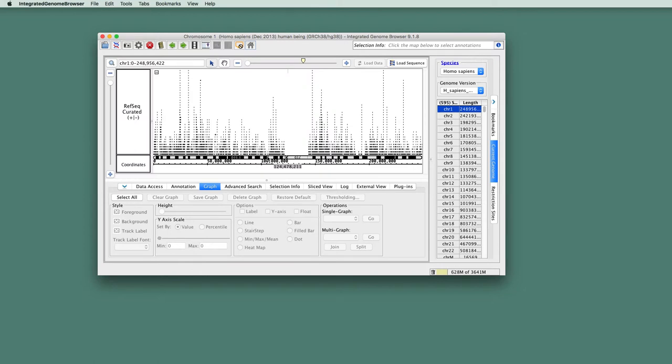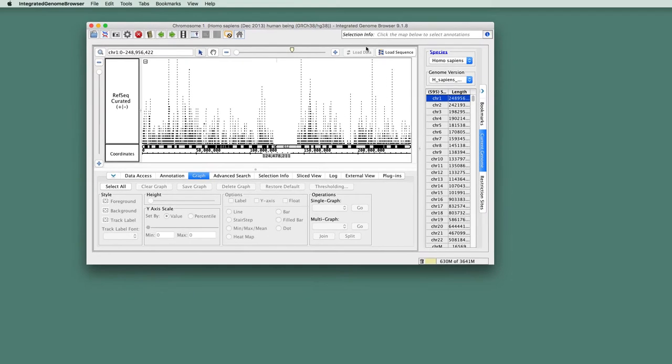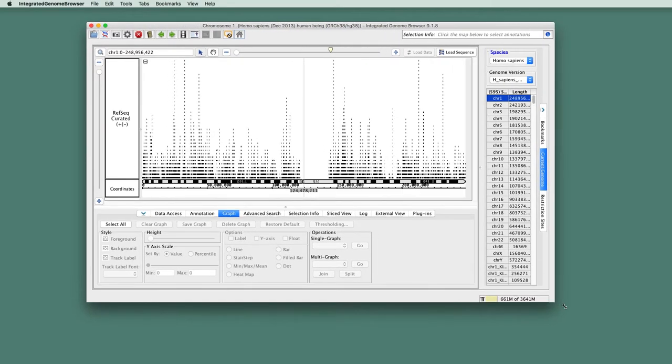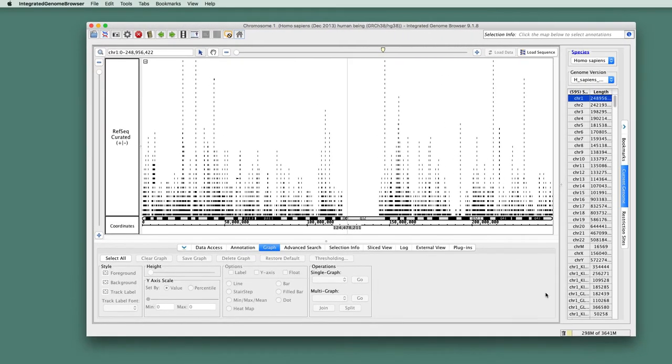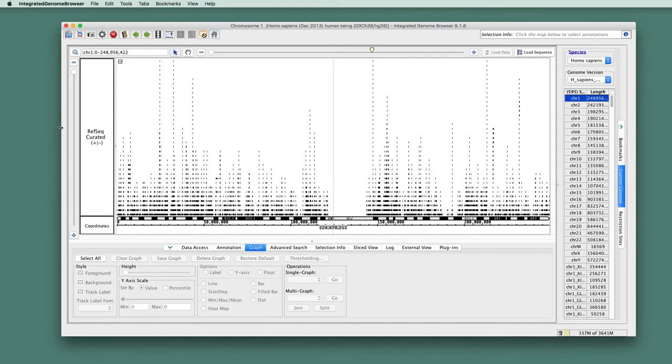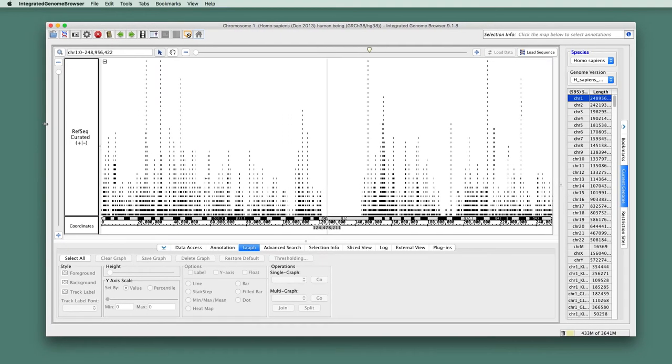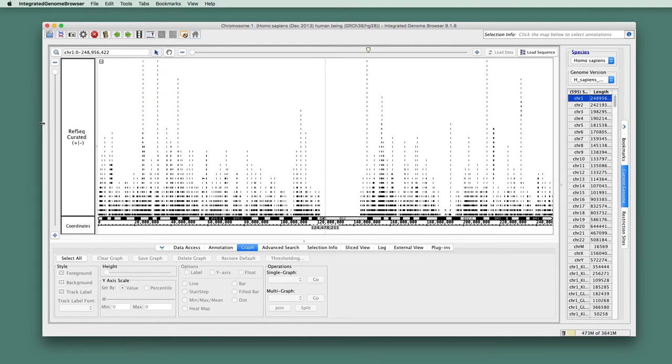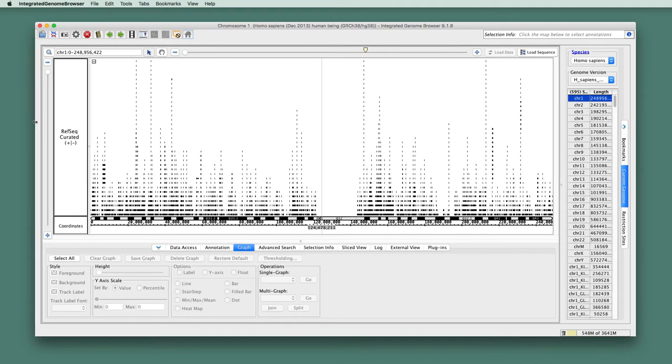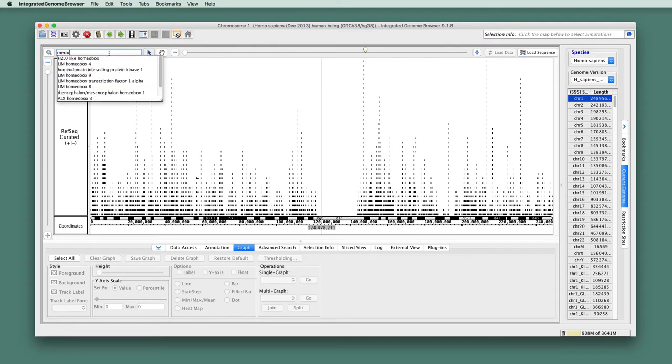ProtoNote is classified as an application plugin or an application app, which means it essentially creates an entirely new, it adds an entirely new window or application to the IGB program. So to demonstrate ProtoNote, let's go to a gene in the human genome, MEOX1.